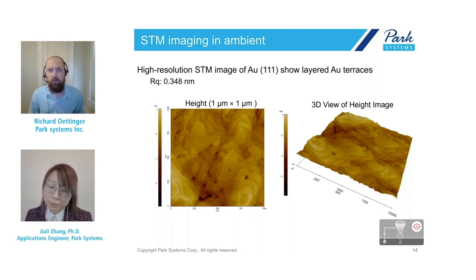And also another way to prevent the tip from dulling is that you can use non-contact mode instead of contact mode or tapping mode, because non-contact mode prevents your tip from touching the surface while maintaining high resolution images.